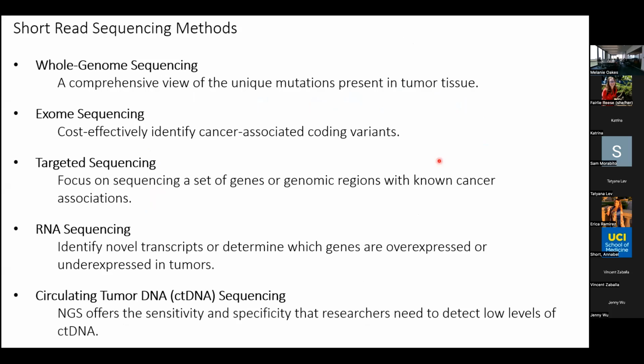So what are we using this short read for? We do it a lot for whole genome sequencing. The cost has come down so much that we can do whole genome at 30x for less than $1,000. And so it's really made a big difference.